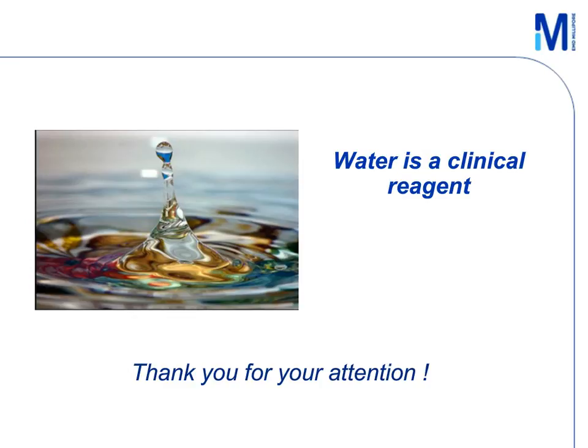Great, thank you. Now, Sean, what are the methods for testing water for bacteria? Well, all of EMD Millipore's systems are equipped with a sanitary sampling port. Why that's important is because you don't want to have a valve that is contaminated with bacteria that you're taking water out of. You're removing water from the system with such a dirty valve, because then you'd just be getting counts that aren't really indicative of the system itself.